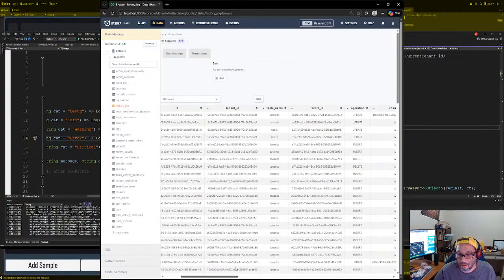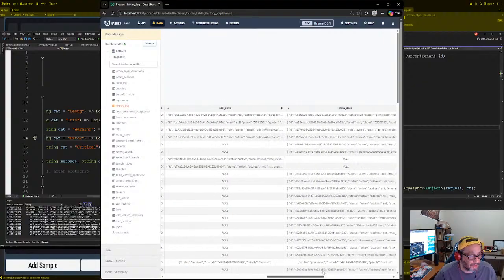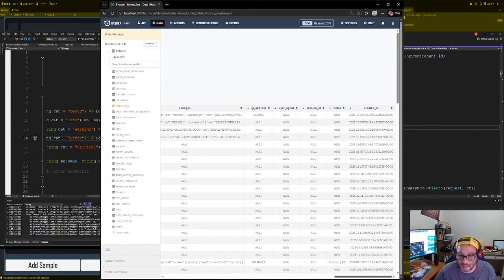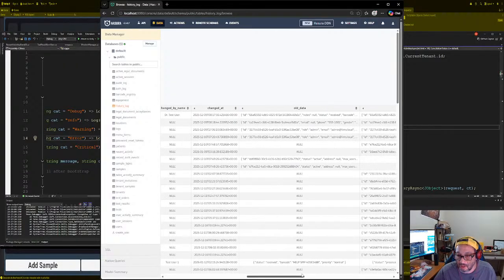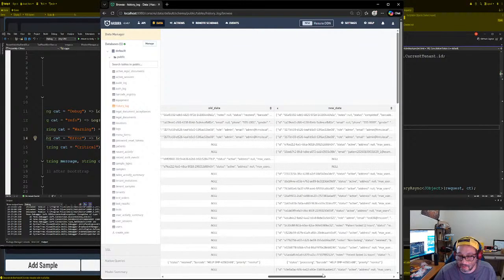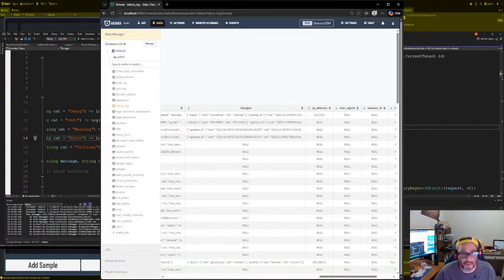Yes, we do. Okay, change by name, created at. We have a created at. Yes, we do. Do we have old data? Yes, we do. Do we have new data? Yes, we do. Do we have changes? Yes, we do. Do we have IP address? Yes, we do. Okay, now it should run.